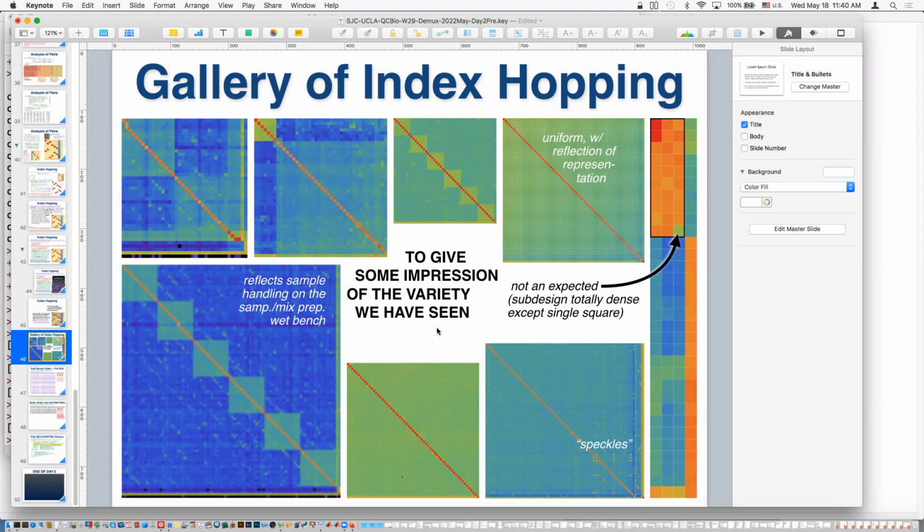you can see that this also tells you that row and column changes are the most common thing to happen. Because if you're a guy on the diagonal and you're a low rep guy on the low side, you hop into rows and columns a little less because it's coming from you and you're lower. Whereas the high rep guy hops into his row and column higher because he's a high rep guy. So here it's clearly going into rows and columns based on fraction representation of the primary. That's what we find.